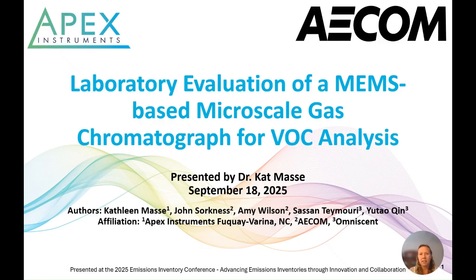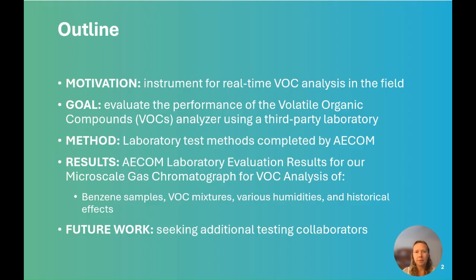Today, I'll be discussing this technology, the VOC analyzer, and I'll be sharing results from a laboratory evaluation of a MEMS-based microscale gas chromatograph for VOC analysis. The motivation behind developing this instrument stems from the need for real-time quantification of volatile organic compounds in the field setting. Given that our VOC analyzer is a relatively new technology, the goal of this work was to evaluate the performance of the analyzer using a third-party laboratory. In this case, we're using AECOM's laboratory in Austin, Texas.